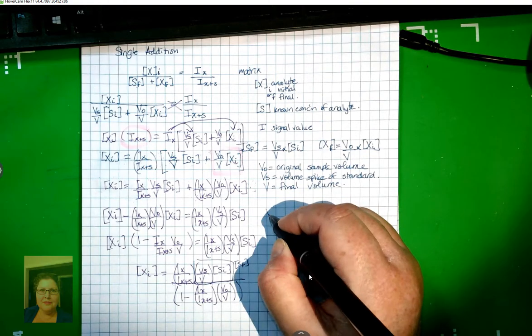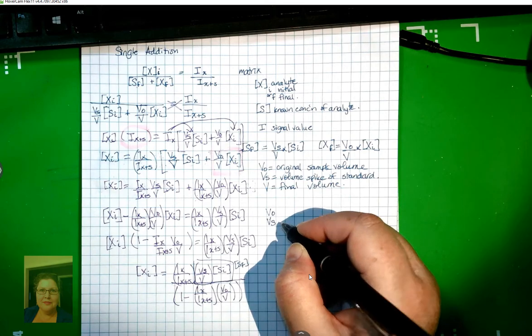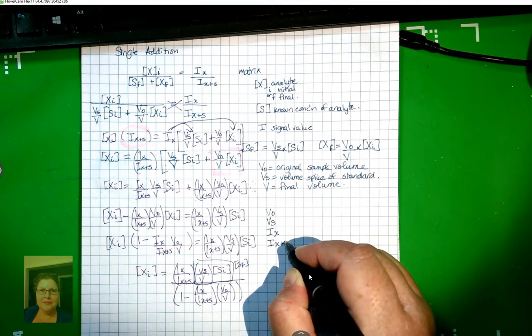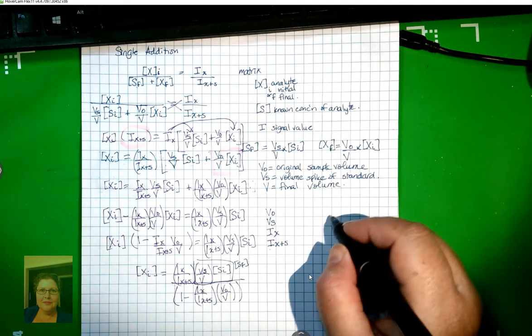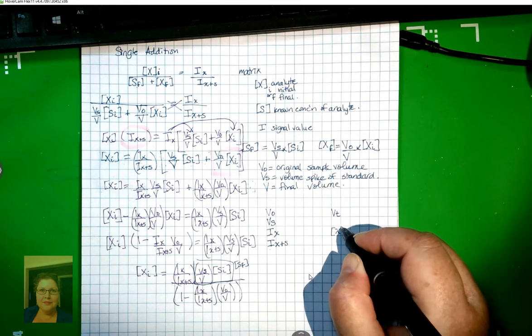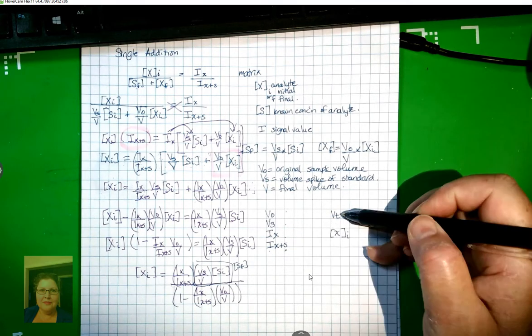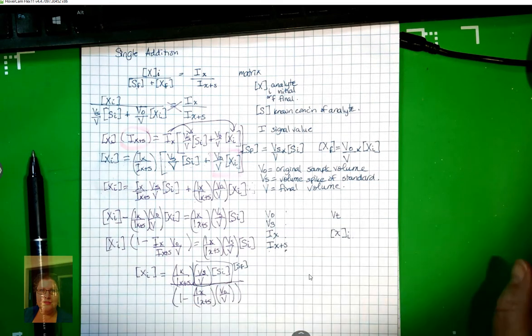I can see that the variables are going to be my initial volume, the volume of my spike, the intensity of my original sample, the intensity of my sample with the spike, and I can solve for a volume total, and I can solve for a concentration of X initially. So these were things that changed with the experiment, and based on this data, I can find this data. So let's go ahead and set up a spreadsheet that will do this for us.